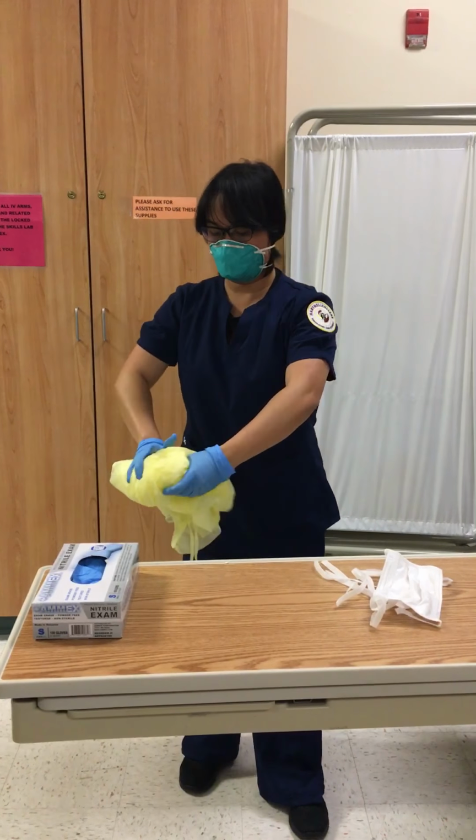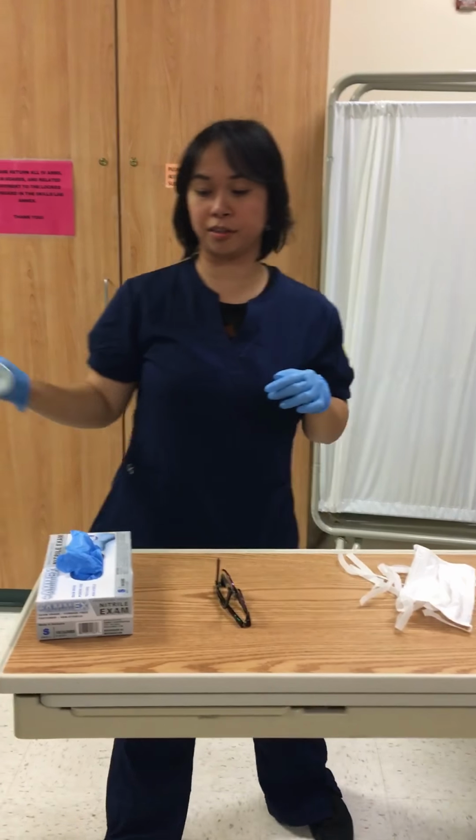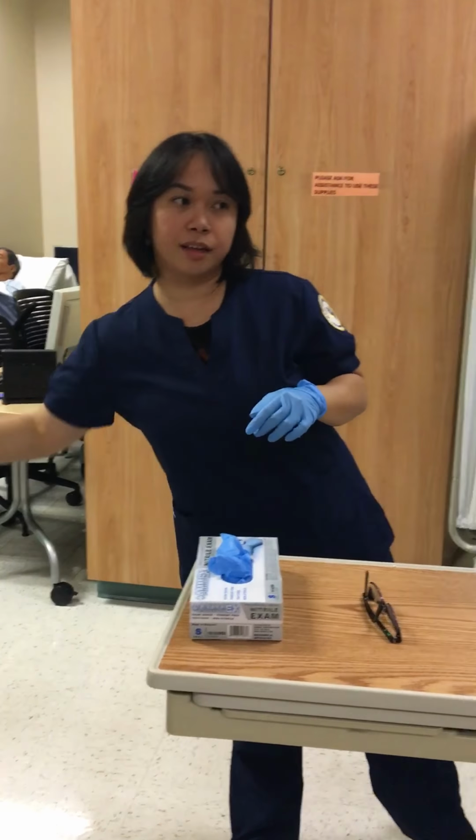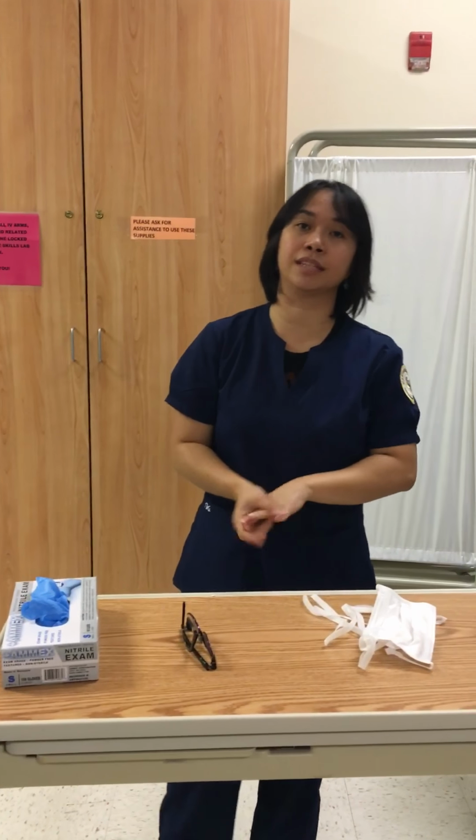So in the ante-room, you go ahead and put on a new pair of gloves. I remove my mask and dispose of that in a biohazard bin, and then I take off my gloves again. And after that, I wash my hands for at least 15 seconds. So that is how you put on PPE and then remove your PPE.